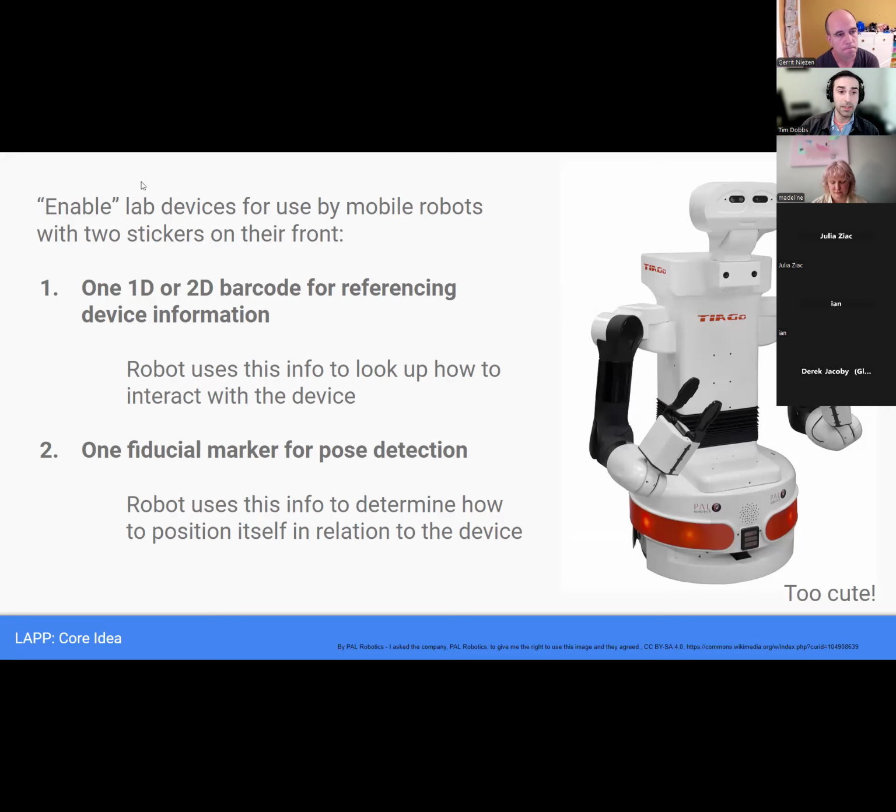One, material movement is challenging in automation, at least in a lab context, because it's pretty trivial for a human to take something out of the freezer and then walk it over to a different lab and then say, okay, I'm going to do my preparation here at this bench, but then I'm going to pick up my sample and go to a different bench. And that's like a huge problem for robotics, actually. And so what they say is, well, cool, let's just get sort of human-like robots, and they say run them like cobots, which is to say it's in a mixed environment where humans also exist.